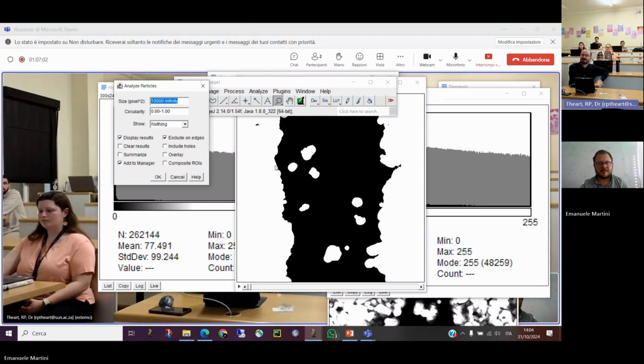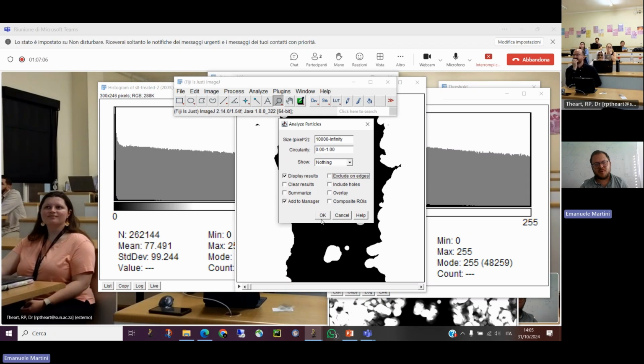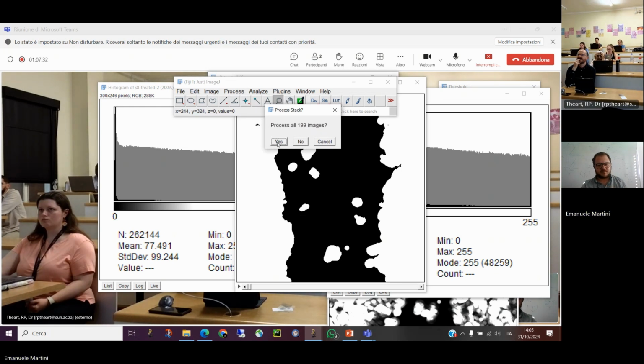Someone says, well, they're all on the edges, so you definitely don't want to exclude them. You want to include only them. If there was an include-only-edges option, you would have used that. So here you are happy, and you say okay. Add to manager and display results. In this case, we want to keep it like this. And of course, you have to tell it to process all the images, the whole stack.